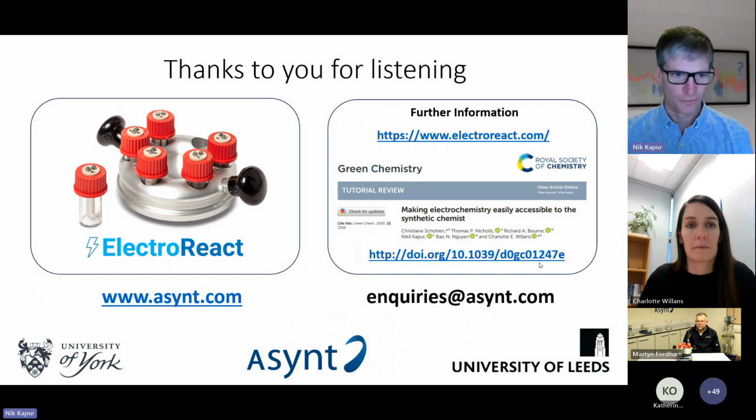And I think what Charlotte's also demonstrated in the website was we've come up with a model that should help you move up in scale or down in scale if you really wanted to between one size and the other. I mean, it is quite specific to the ElectroReact because some of the assumptions you have to make are about the degree of mixing, but between our 2 sizes, I think they're fairly good assumptions.